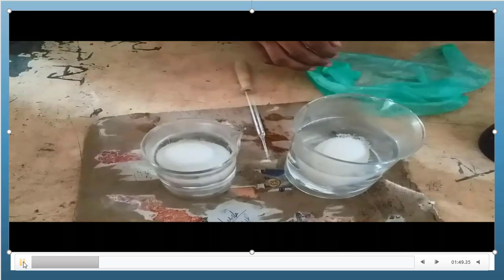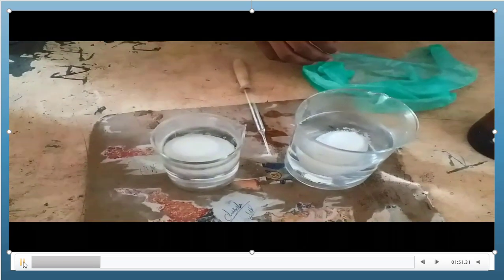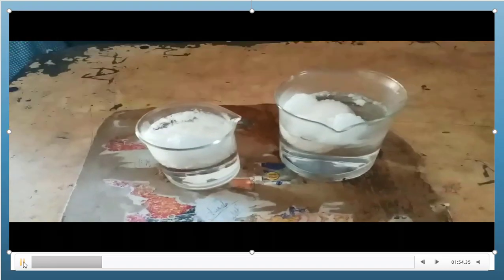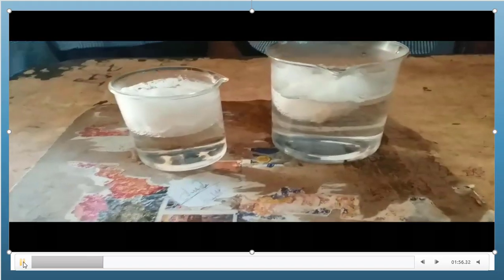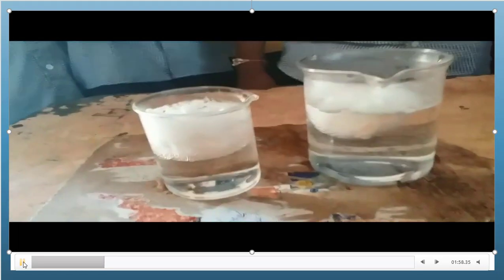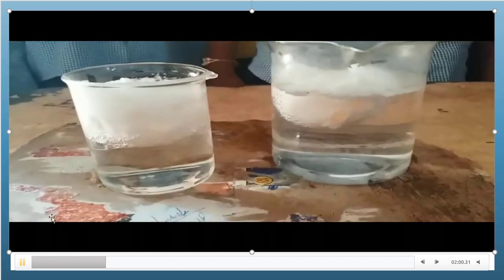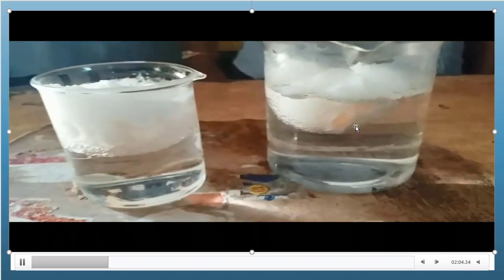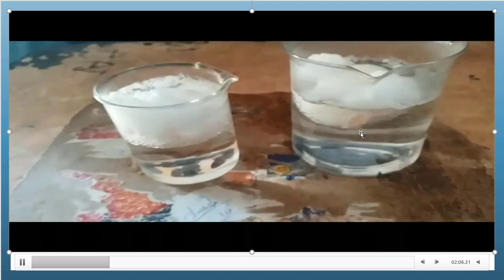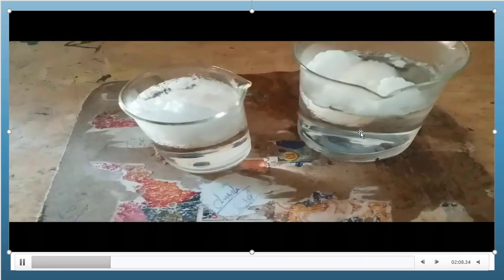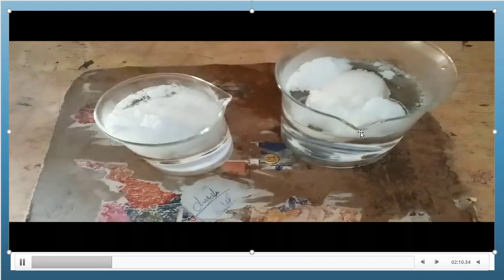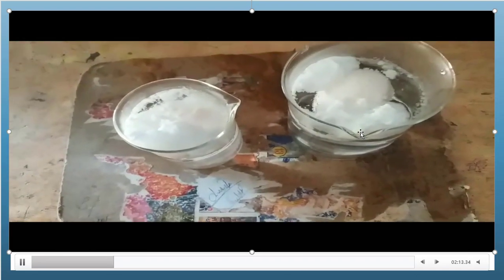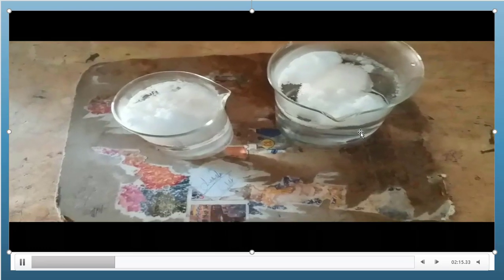The eggshell is made up of calcium carbonate, which dissolves in HCl. You can observe how the eggshell is dissolving in HCl. We have to keep these eggs in HCl for 5 hours.